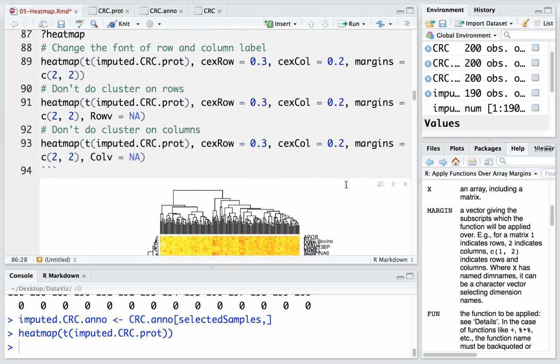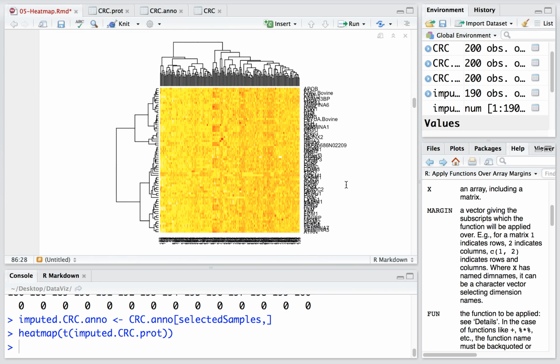It's quite simple, but we feel actually the heat map is not good. We almost see nothing from the heat map. It's all golden color. Probably there are some dark golden color here, but it's not very clear what happened in the dataset. So we really want to see the difference. We want to see something from the heat map. So the first thing we want to do is change the color in the heat map.